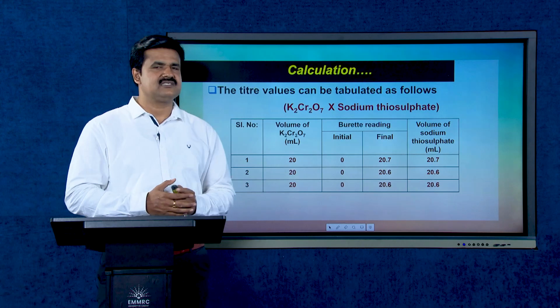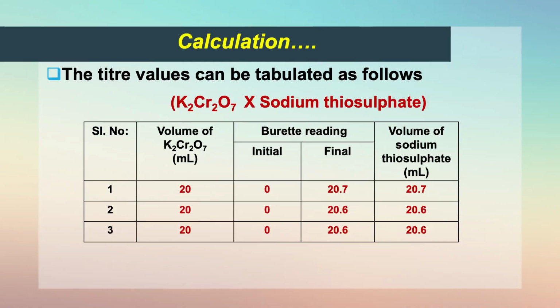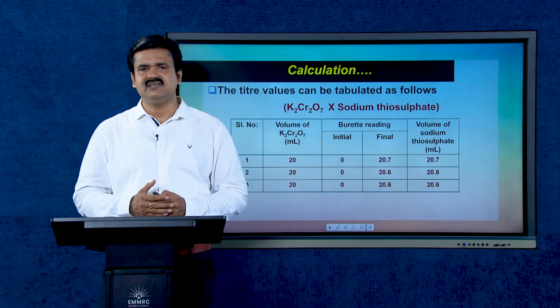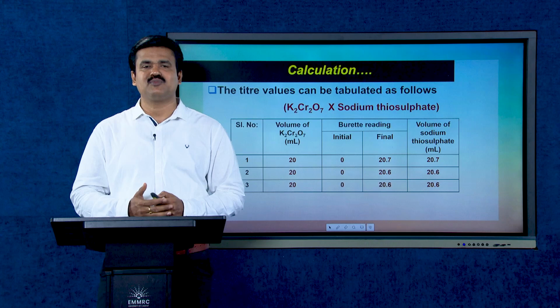From this chart, the concordant value for the volume of sodium thiosulfate is 20.6 ml.